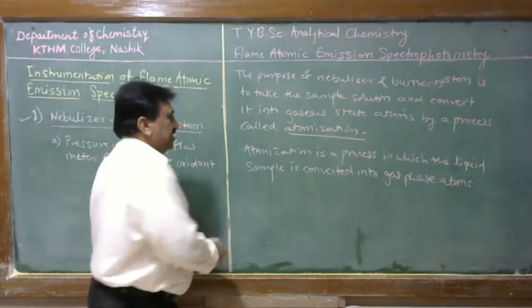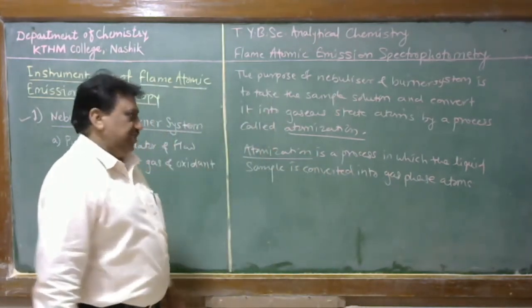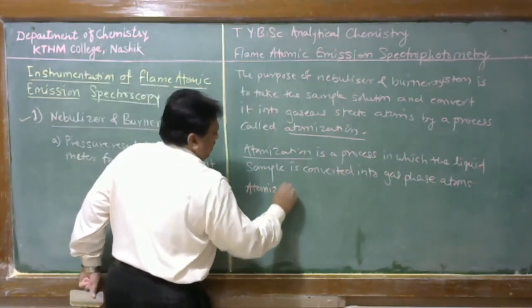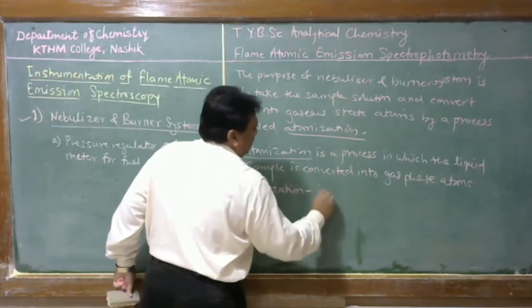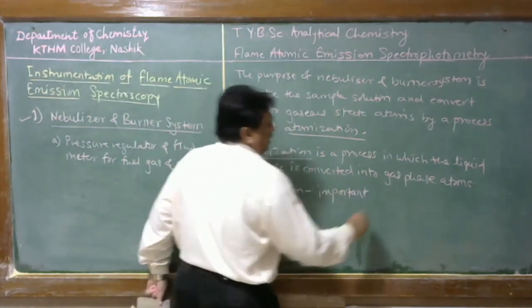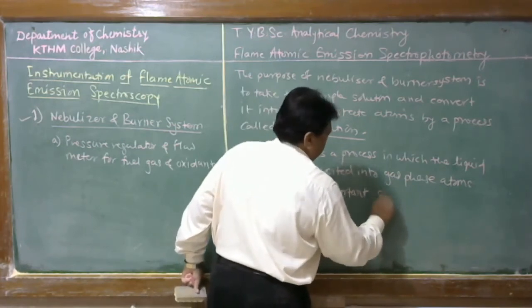Therefore, atomization is the first and an important step in all spectroscopic measurements. Atomization is a very important step in atomic spectroscopic measurement.